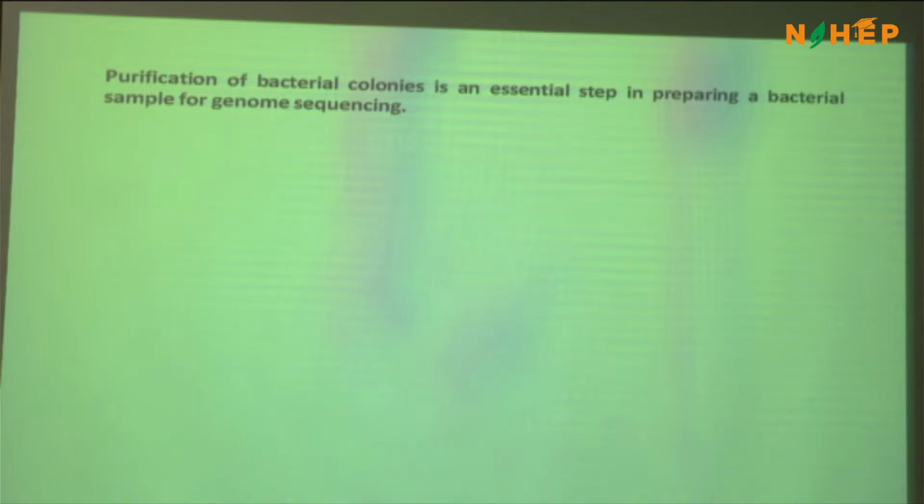Microbiological purity means the bacteria should be free from all other bacterial species. Genetic purity means it should represent that particular strain of bacteria which you are interested in. Remember, the same species can have two different isolates. They may coexist in the environment. Correct? Especially, we have seen this in our own data sets.